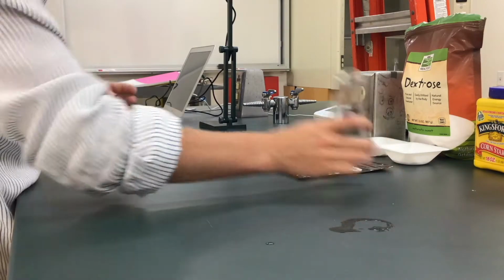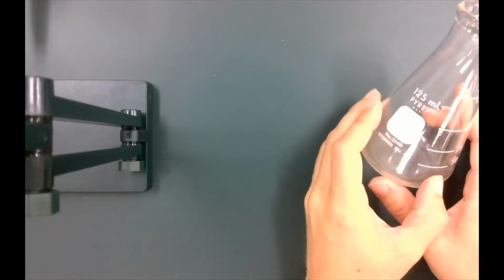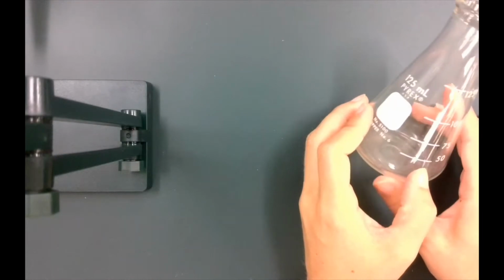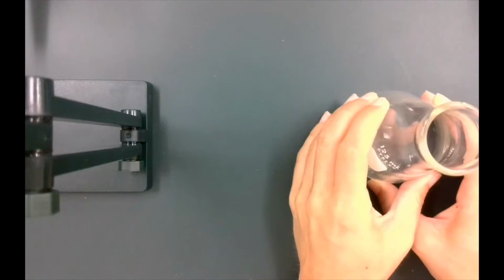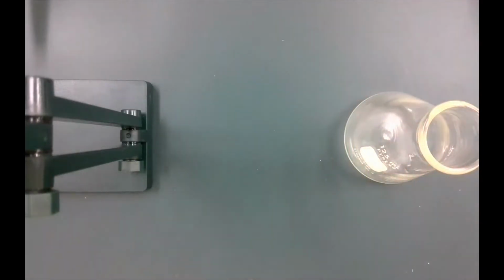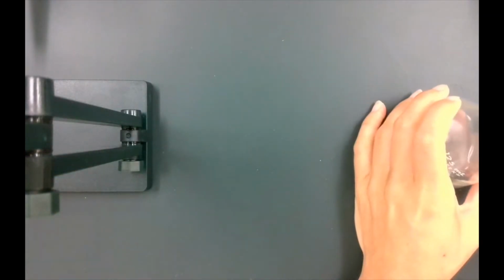And instead, we're going to prep our glucose solution and our starch solution in an Erlenmeyer flask. And to do that, we're going to need a volume of distilled water. I've got some distilled water right here. This is what we're going to use to dissolve our material.